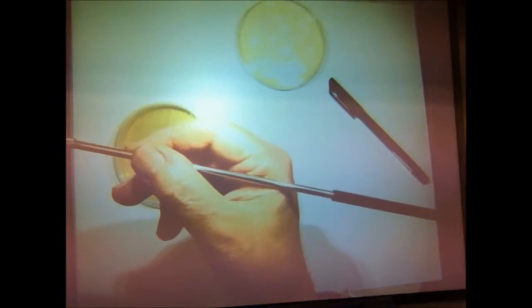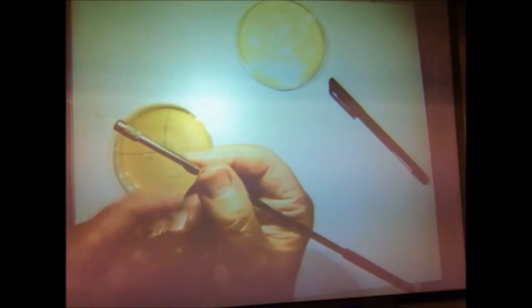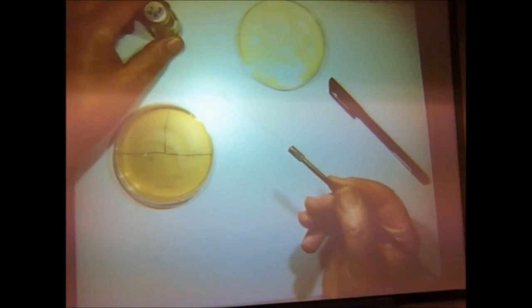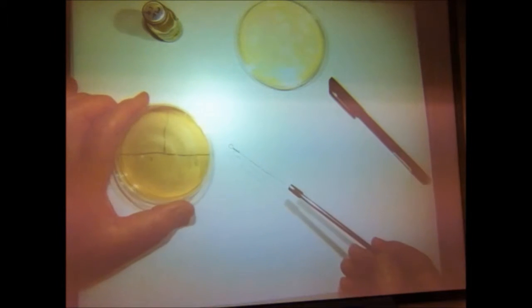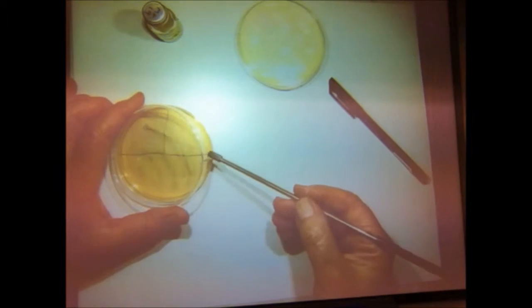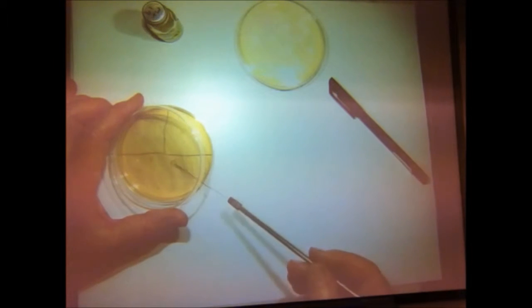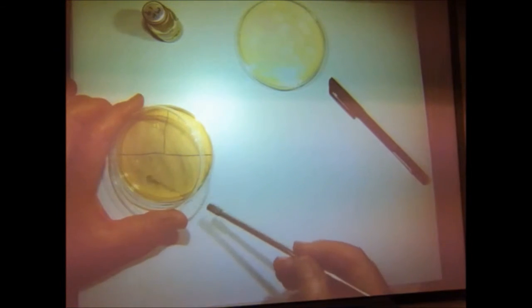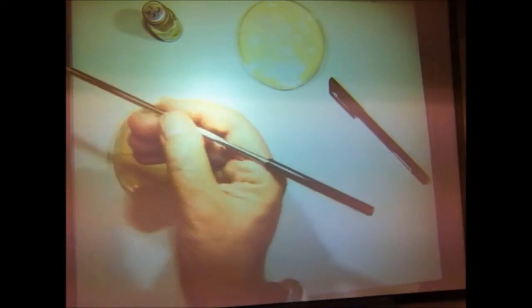I'm going to flame the mouth of the culture bottle again, rotate the bottle, and now I'm ready to start streaking. So what I'm going to do, I'm just going to lift the lid up the bare minimum and reach underneath and very carefully draw across the surface and down into that bottom half, and away we go. Sterilize the wire loop again. I'll do a second one.